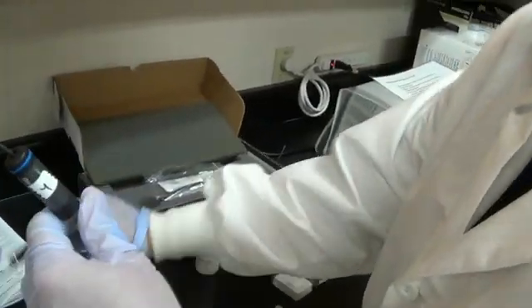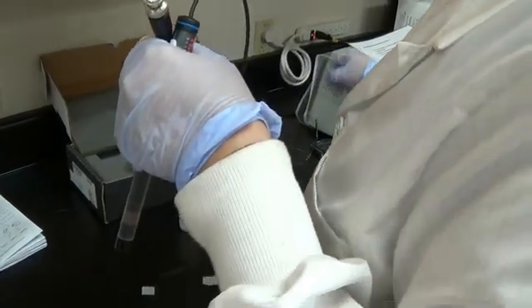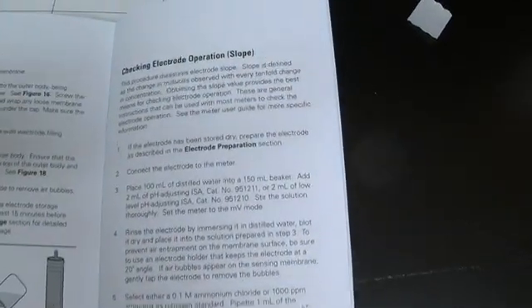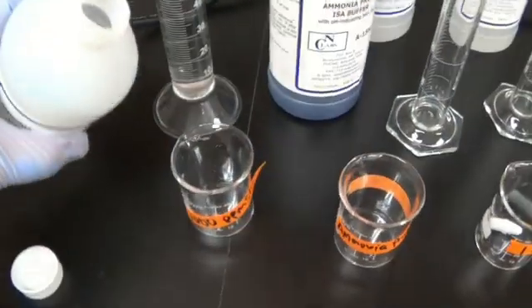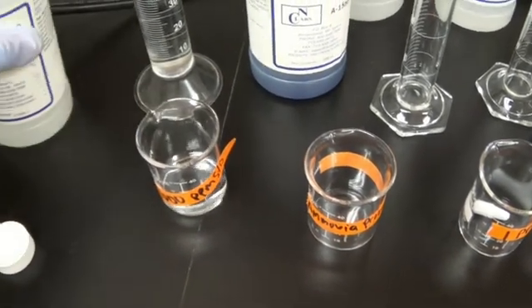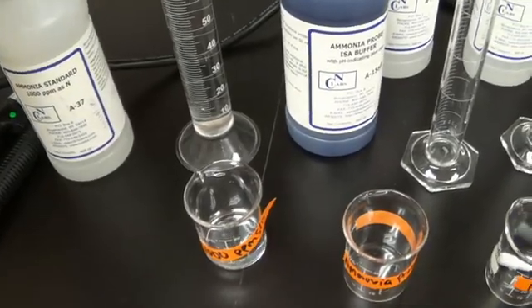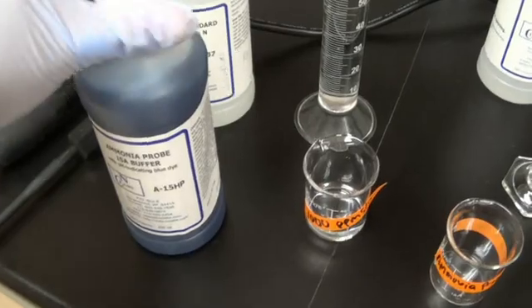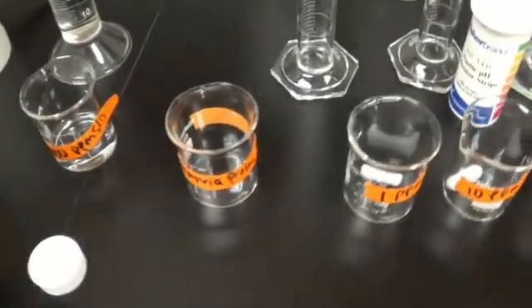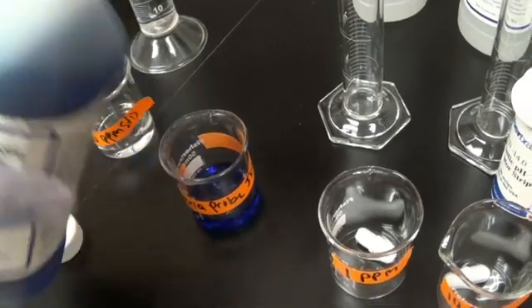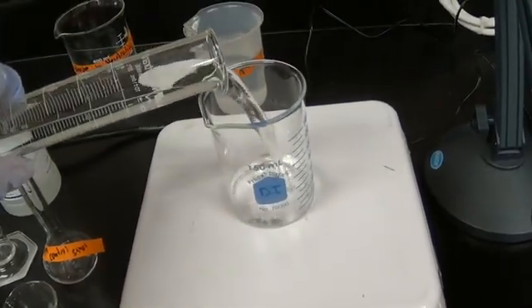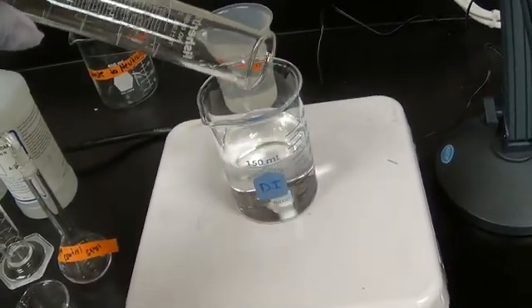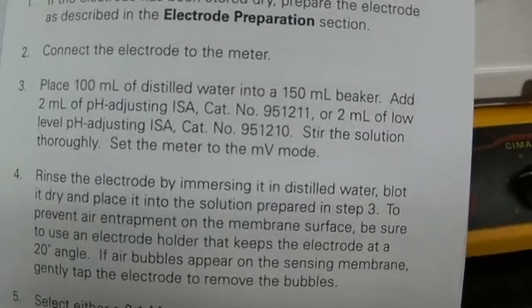Next thing is I hook it to the machine and put it in the storage solution. And we should be ready in about 15 minutes. Next we're going to do the slope test. So first I'm going to pour off a little bit of my 1000 standard into a labeled beaker, pour off a little bit of my ISA buffer to a labeled beaker. So first I'm going to add my 100 ml of DI water. Next it says to add the 2 ml of the ISA.